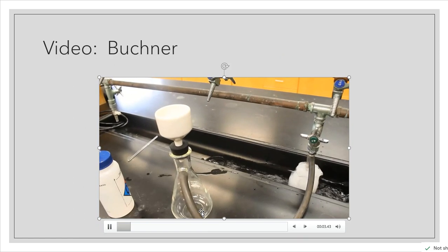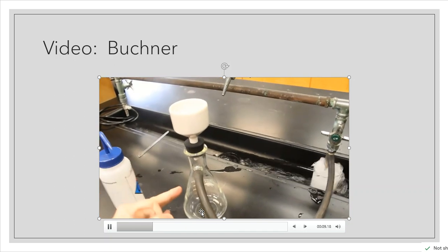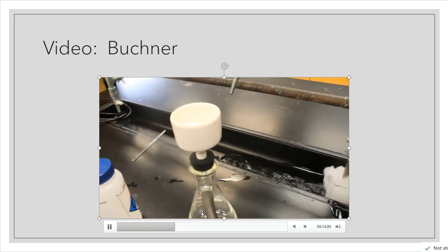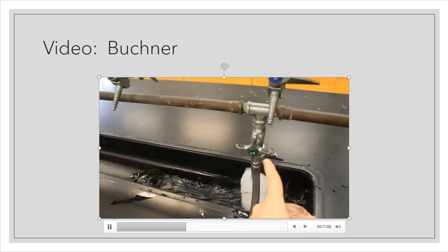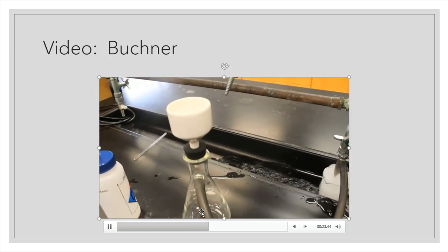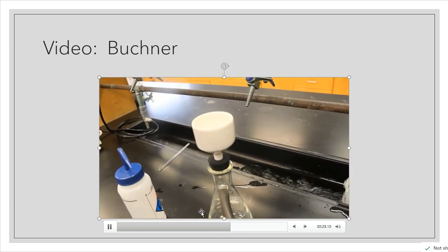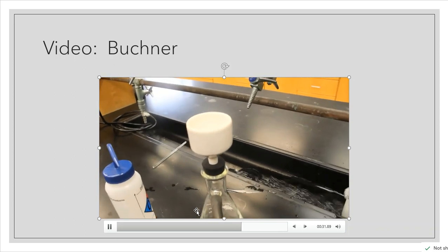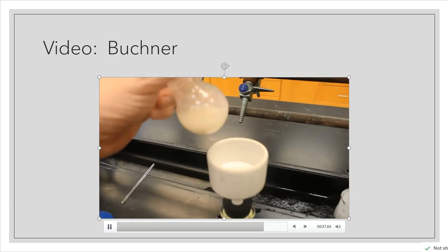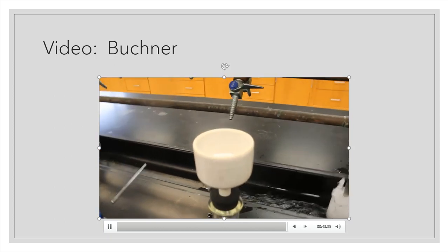Okay, so guess what? We're at the transcinnamic acid and I'm getting ready to filter. Once again, just to reconfirm it, I've got a filter flask. On top of the filter flask, I have a Buchner funnel. In the Buchner funnel, I have a piece of filter paper. And then the water has been turned on at the faucet in order to create this suction so I can begin to pull my liquid through the filter paper. And that way, my transcinnamic acid crystals, of course they're not trans anymore, are going to be up here on the very top. All right, so I'm going to pour these things through. Here is the flask. This is what it has finally decided to look like. And I'm getting ready to filter.